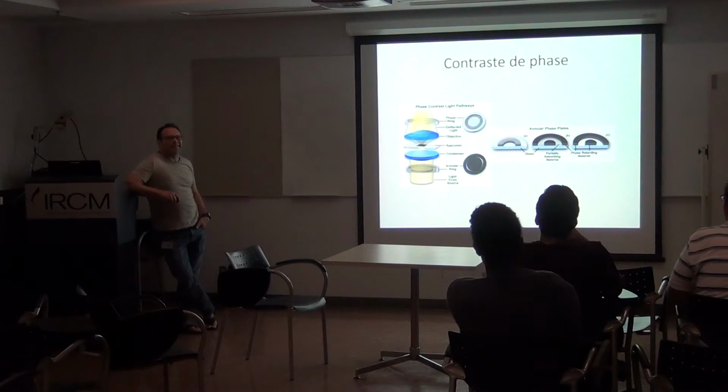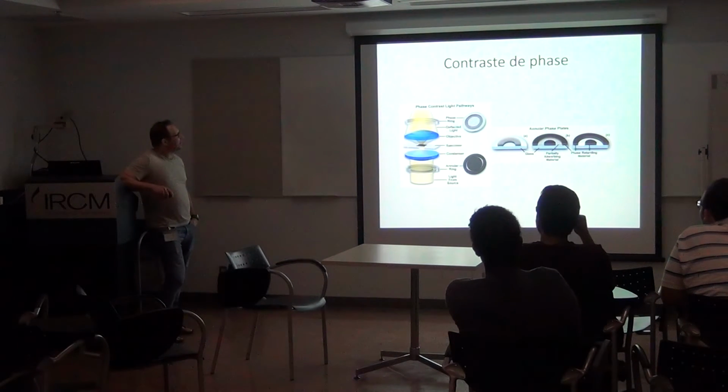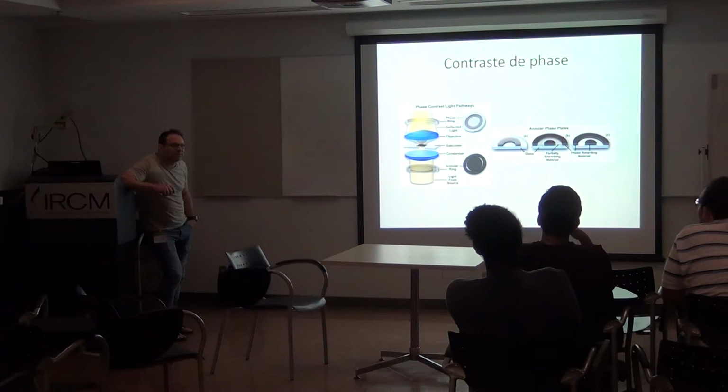The green is not really so important. It will work also with white light. So, yeah. What's the advantage of using phase contrast over fluorescence, for example?